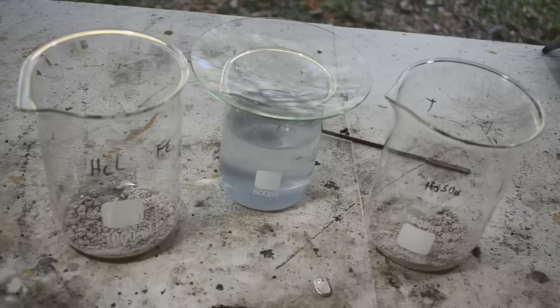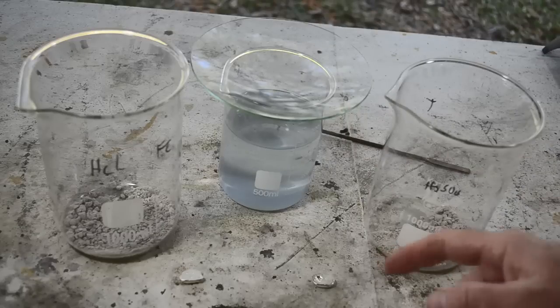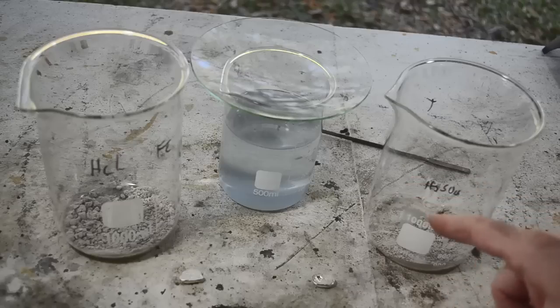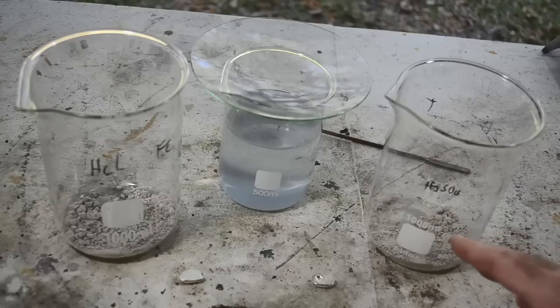They look about the same, okay? Now, clearly, the sulfuric acid treatment did take something out of there because the liquid turned blue, all right? So we got something out of there. I'm certain it's copper. It probably made copper sulfate. Copper sulfate's very blue, so it just took a little trace of it and turned the liquid blue.